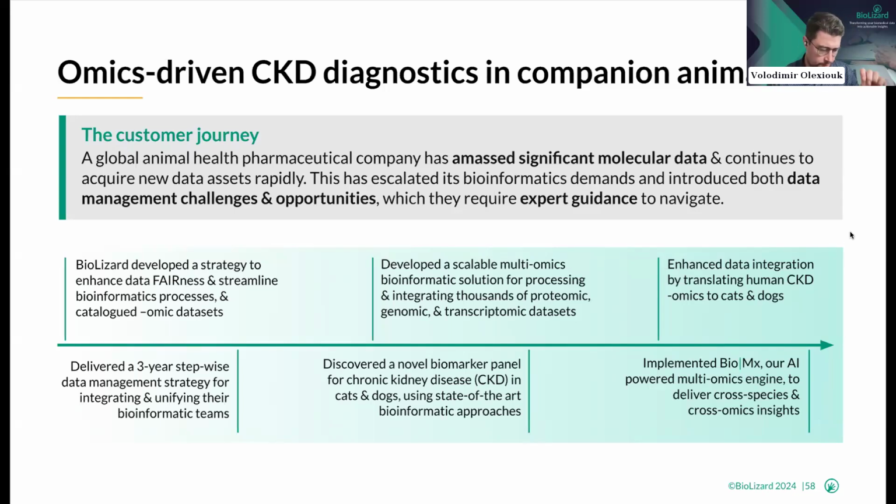So a small introduction, but I would like to briefly walk through a case study whereby we showcase some benefits of applying single cell level technologies to the multiomics, but we also envision a spatial component to further supplement our multiomic solution. To provide you with a little bit of context, we collaborated over a larger period of time with a veterinary company focusing on animal health. More specifically, they accumulated a lot of data for cats and dogs across different diseases.